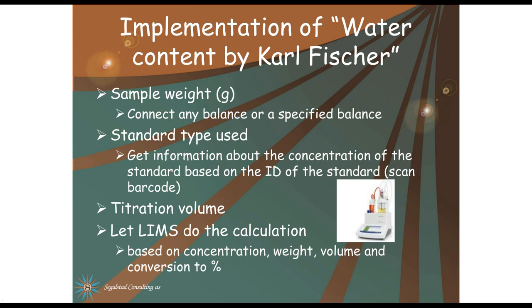Here's another, Karl Fischer, where we titrate to find the water content of the sample. When we enter this method as static data, that is, implement this in LIMS, there are several considerations for how to do this. We need a sample weight measured in grams, which we get from a connected balance.